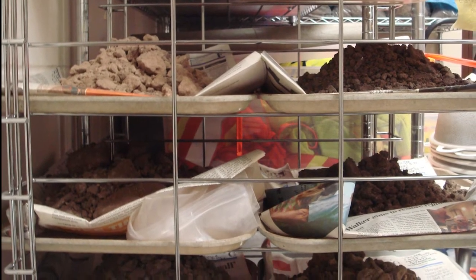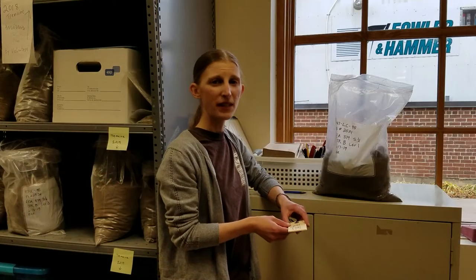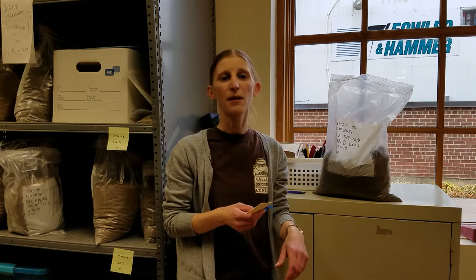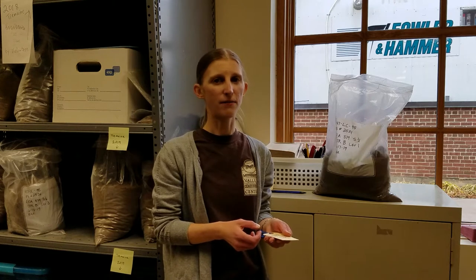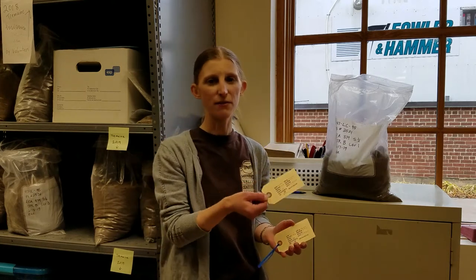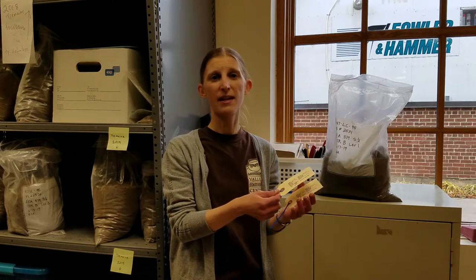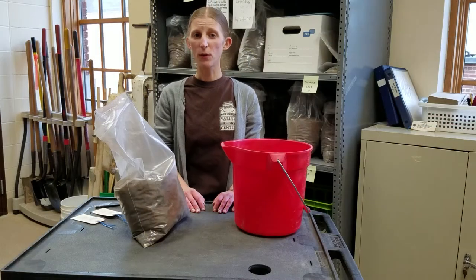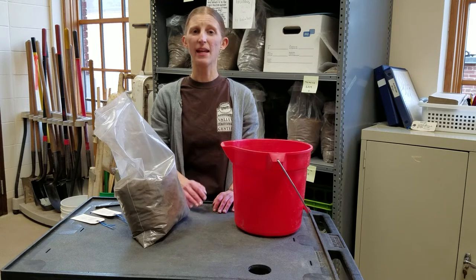Once the sample is dry, we need to record some information about it before we do anything else. The provenience information written on the bag in the field must stay with the light and heavy fractions as they're processed — that's the only way to know where each sample came from and how the artifacts and remains in it relate to the rest of the site. So before we float each sample, we make a tag for the light fraction and another for the heavy fraction. Both tags have the provenience and another crucial piece of information: the volume of the sample. If you know the volume, you can figure out the density of plant and animal remains and artifacts within it.